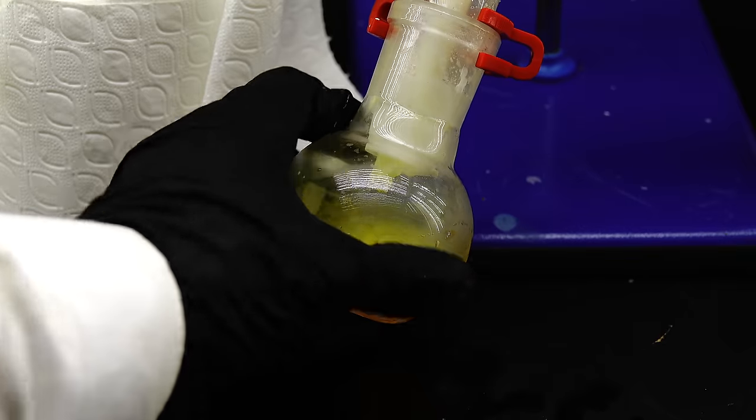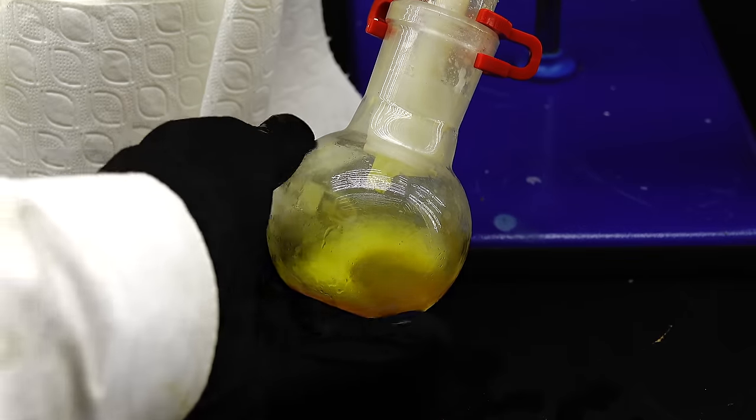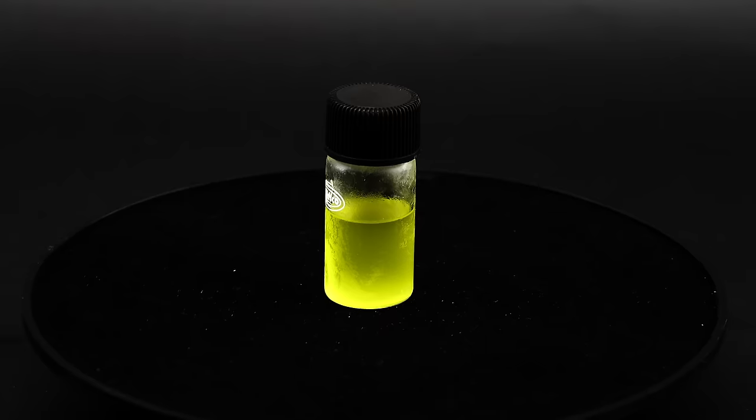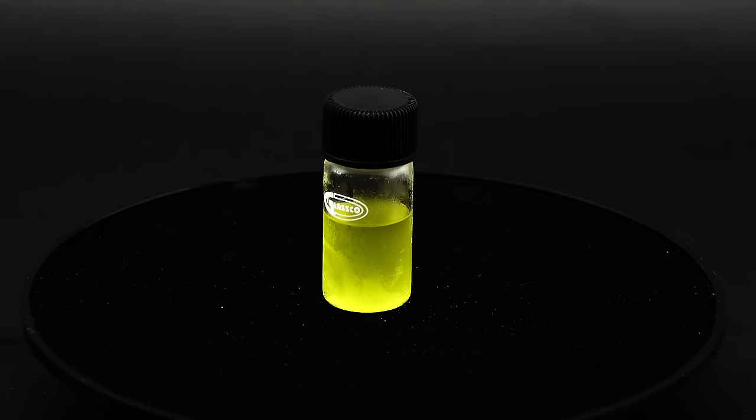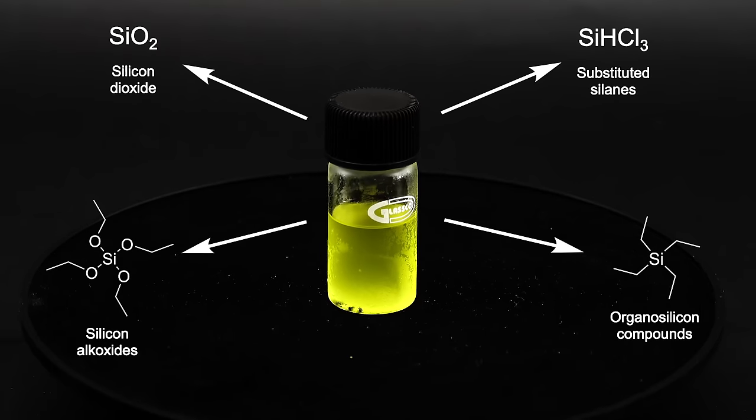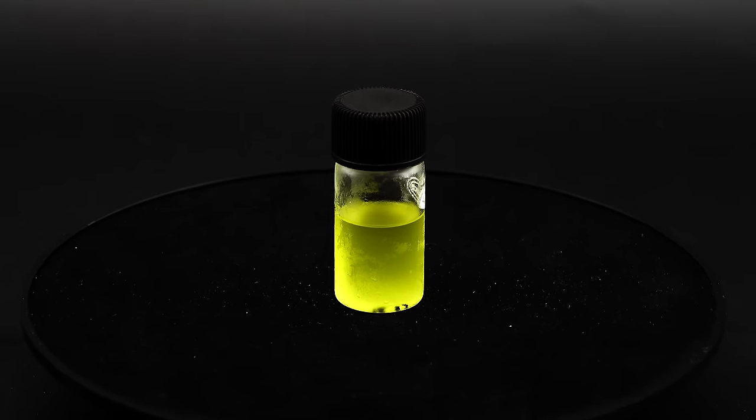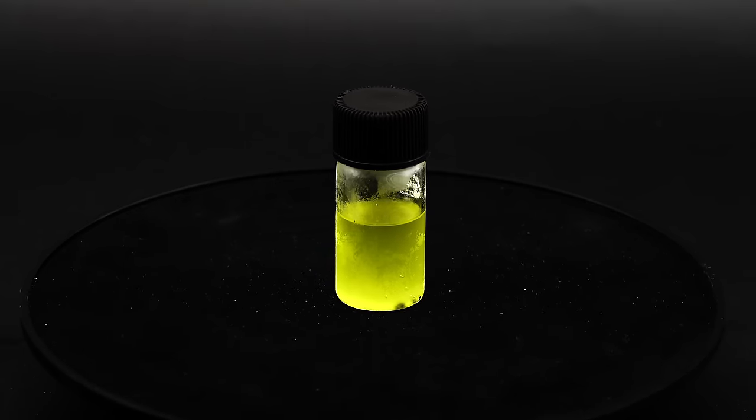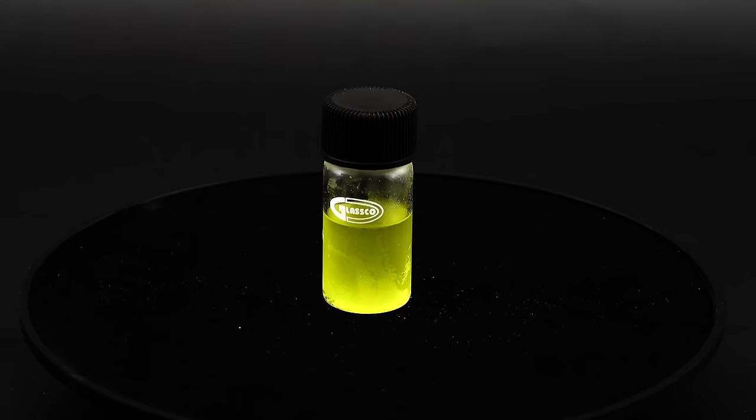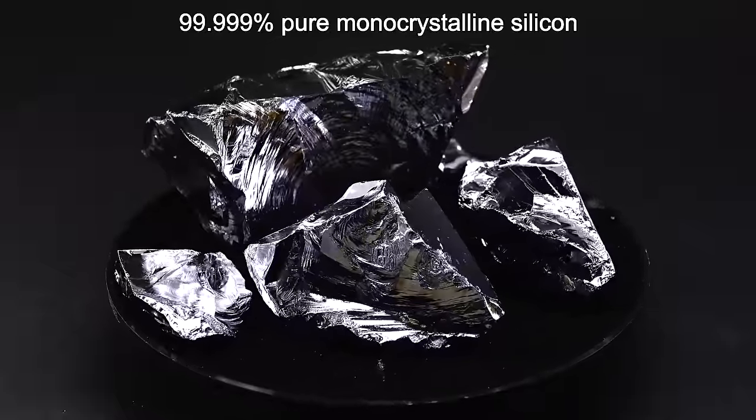You might ask yourself, what's the deal with silicon tetrachloride and why am I making it? Because at first glance, it just looks like a random silicon containing thing. Well, I like to think of silicon tetrachloride as a gateway to hundreds of other useful silicon containing compounds and it is also very technologically important because it allows for the purification of elemental silicon which can quite easily be converted into it and the resulting tetrachloride can be then distilled and turned back into silicon, greatly increasing its purity.